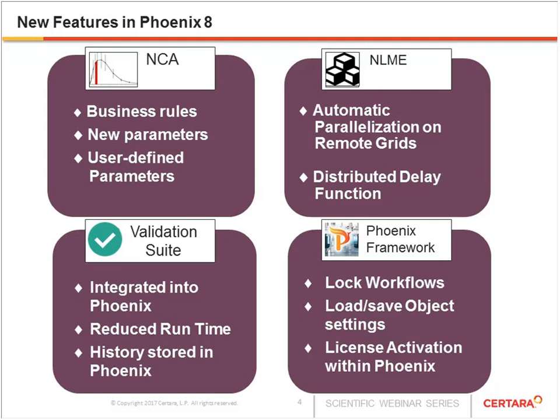So these are features that affect all of the features of Phoenix. So whether you have a license for IVIVC or WinNonlin or NLME, you can take advantage of these framework features. So the first is we've added the ability to lock workflows. So you can apply a password to workflows, and you can lock them from any changes. You can still generate results inside those workflows, but you can't make any changes to the settings.